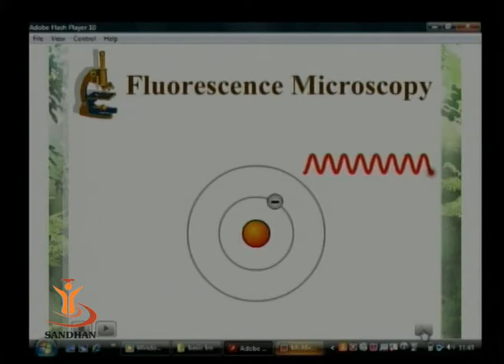Now, how this property of fluorescence has been employed in fluorescence microscopy is interesting. We know that the resolving power of a microscope depends very heavily upon the wavelength of the light.